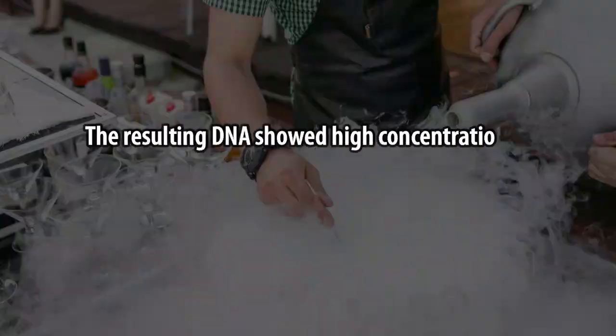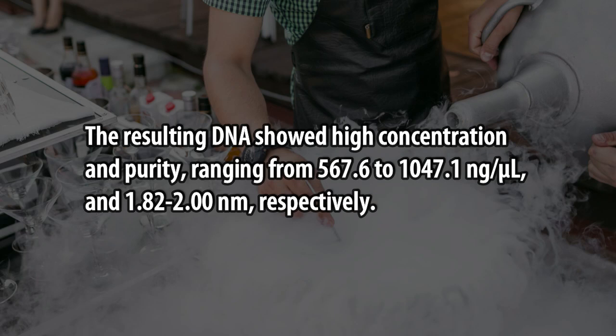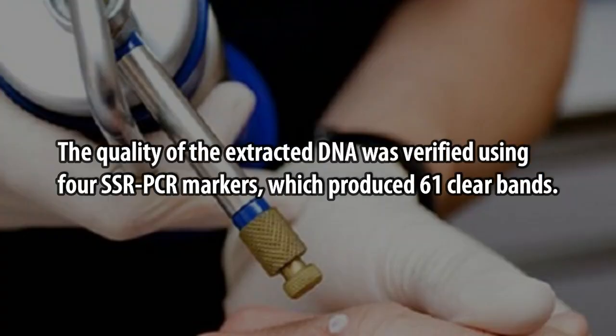The resulting DNA showed high concentration and purity, ranging from 567.6 to 1047.1 ng/µL and 1.8 to 2.00 A260/A280, respectively. The quality of the extracted DNA was verified using four SSR-PCR markers, which produced 61 clear bands.